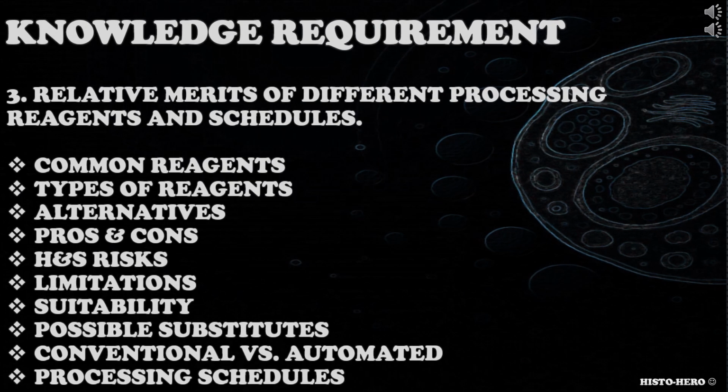The third knowledge requirement is relative merits of different processing reagents and schedules. Candidate needs to have the knowledge and understanding about merits of different processing reagents and schedules.